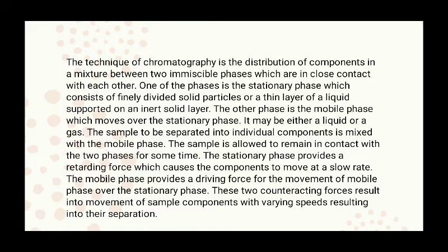The technique of chromatography is the distribution of components in a mixture between two immiscible phases which are in close contact with each other. One of the phases is the stationary phase, which consists of finely divided solid particles or a thin layer of a liquid supported on an inert solid layer. The other phase is the mobile phase, which moves over the stationary phase. It may be either a liquid or gas.